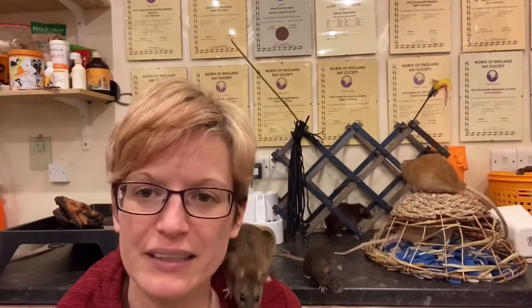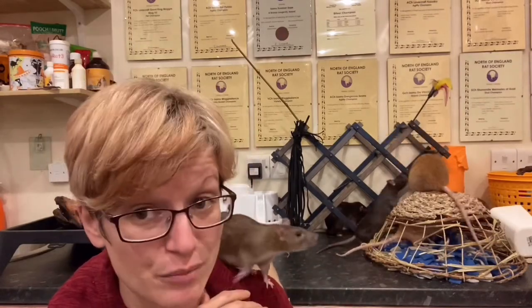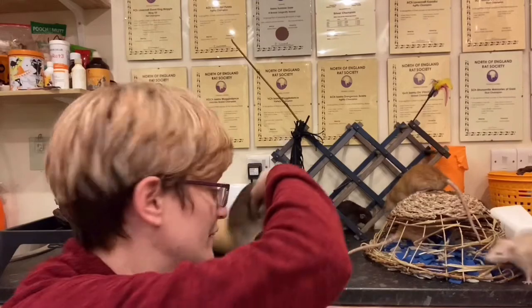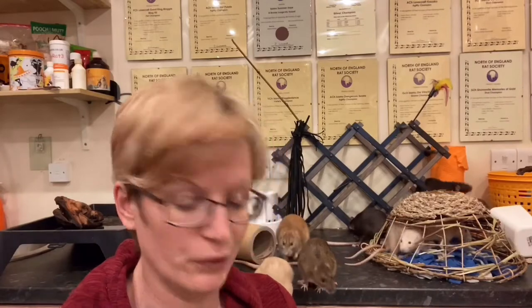With the rest of the figures on there, they don't tell you a huge lot for rats because they're not really sensitive enough. In humans, for instance, leukocytes is really useful, but in rats it's a bit unreliable. It can indicate an infection in humans, but it's a bit of a misleading reading in rats, so I would not rely on that on its own. So: protein, blood, and glucose — why are those useful?